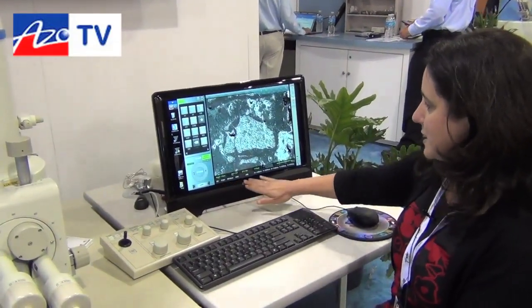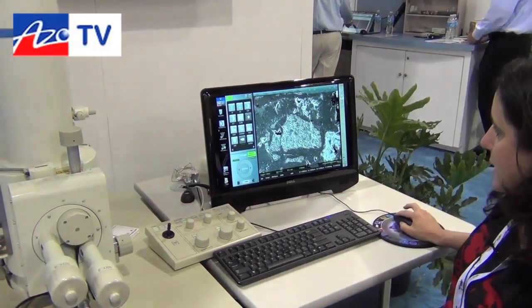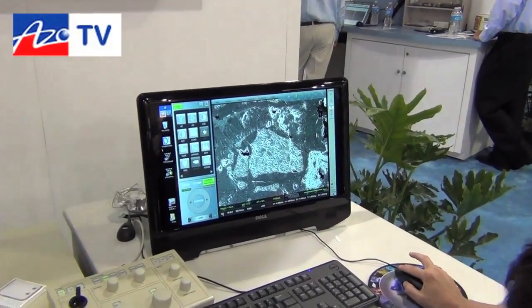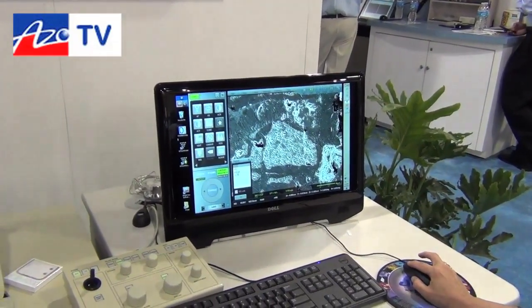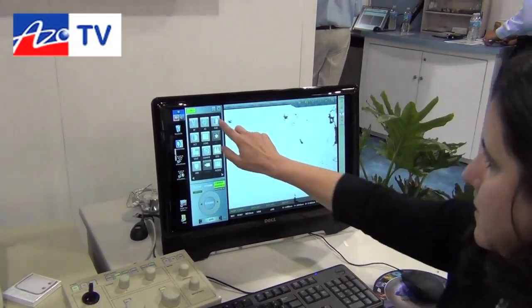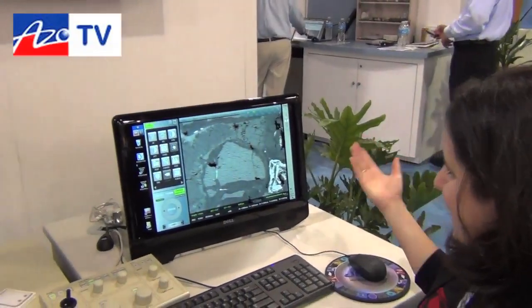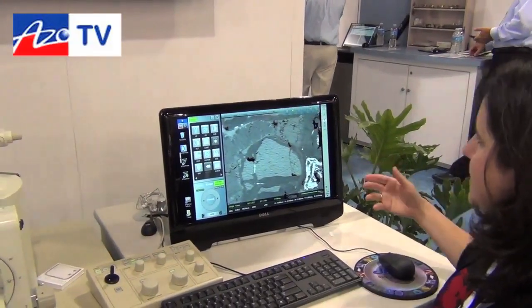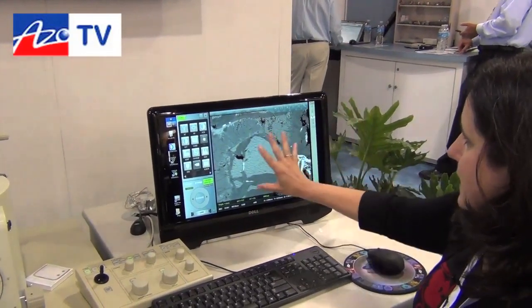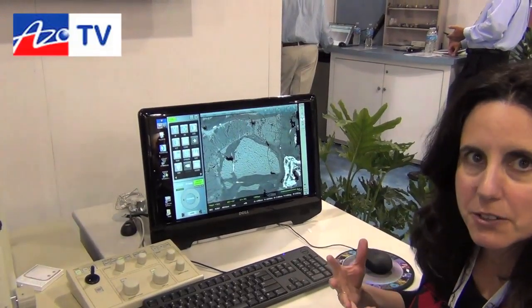Your imaging conditions are always displayed on the bottom and it's very simple to change. I'm using a secondary detector now. If I want some compositional information, I'll change that to my backscatter. My favorite button — auto contrast and brightness.